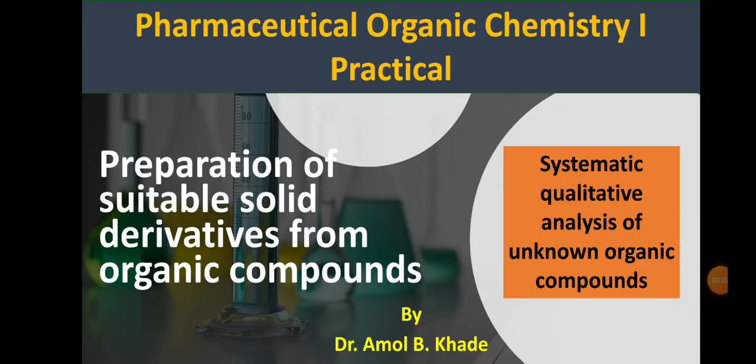Hello students, welcome back to this video session of Pharmaceutical Organic Chemistry 1 Practicals. In this video session, we are going to discuss an important concept, that is derivative preparation. It is the preparation of a suitable solid derivative from the given organic compound. Now we are discussing the systematic qualitative analysis of unknown organic compounds.